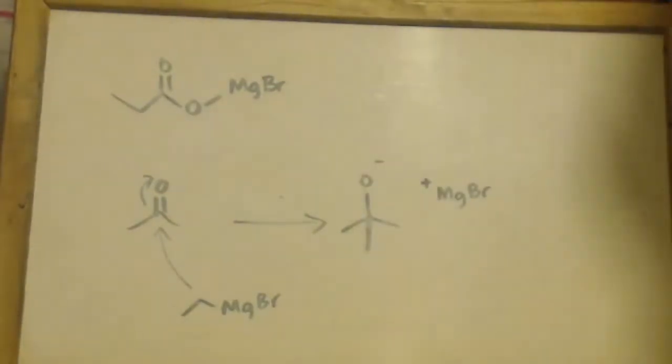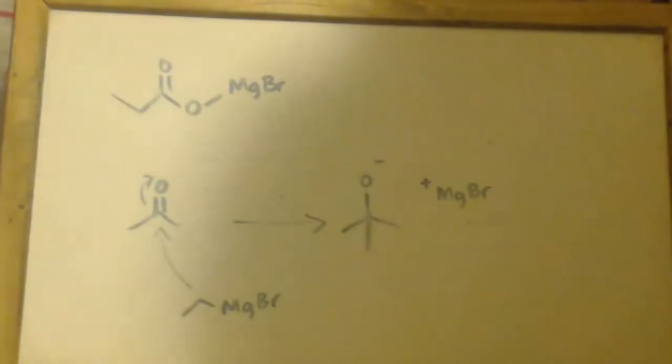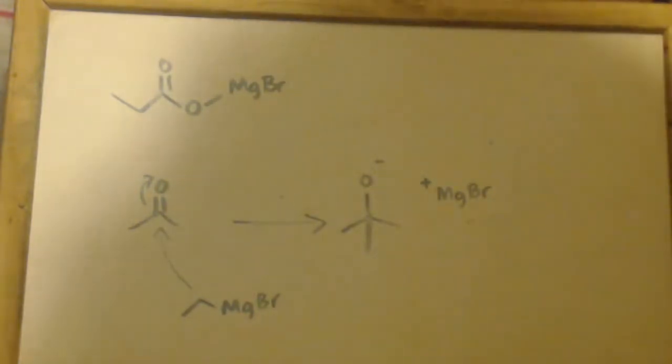John Black, Super Chemist. Believe it or not, this is part 5 of this Grignard reaction. It's actually going to be a part 6 too. But in this part 5, I'm just going over the stoichiometry, mistakes I made, and so on.